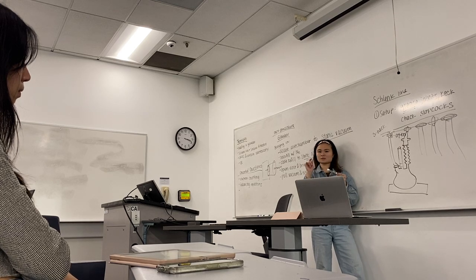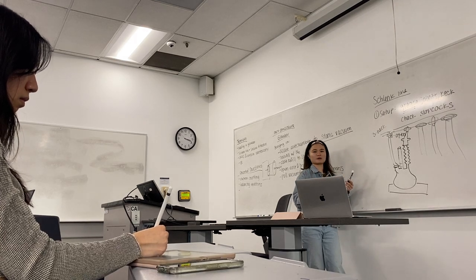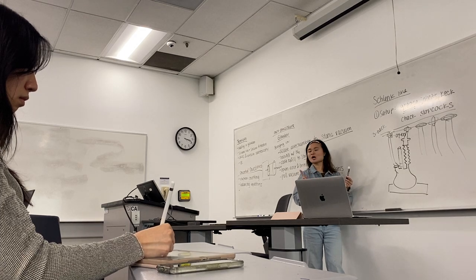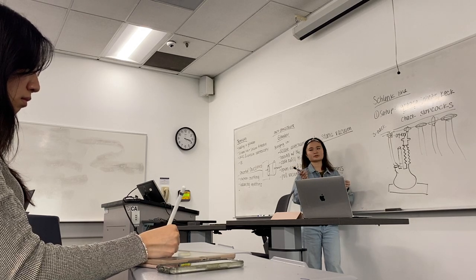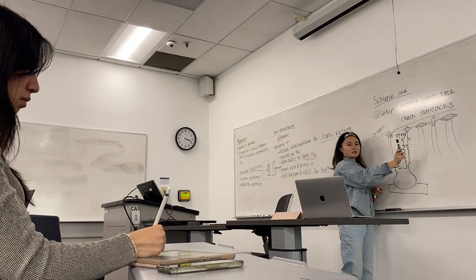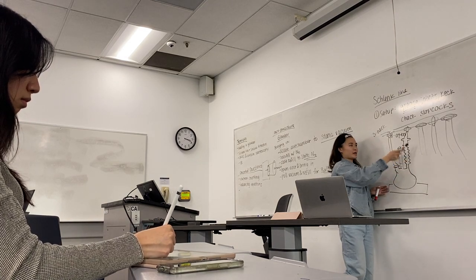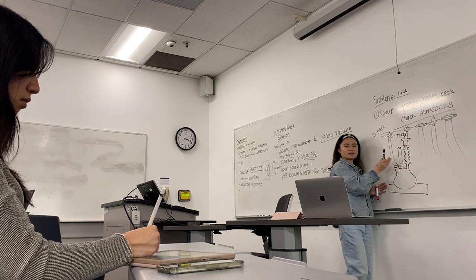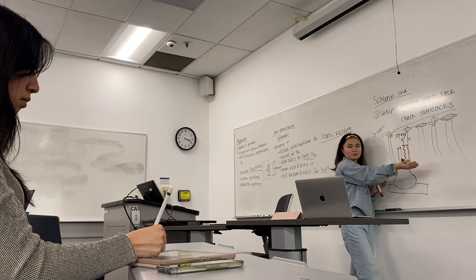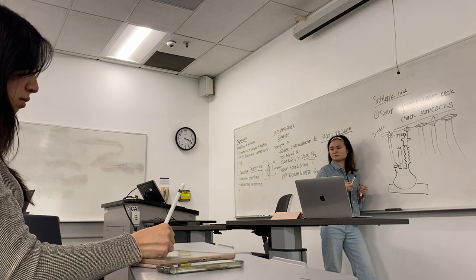Okay, and then let's add one more. Why did we not use liquid nitrogen traps in the class? What can liquid nitrogen condense? Liquid oxygen. So one of the biggest lab safety rules anyone will ever tell you is to never leave a stopcock open to an open environment. If it's not connected to a setup, it cannot be open because it can pull oxygen into the system, and if you have a trap up, it will condense liquid oxygen.